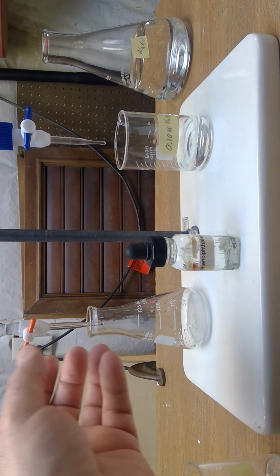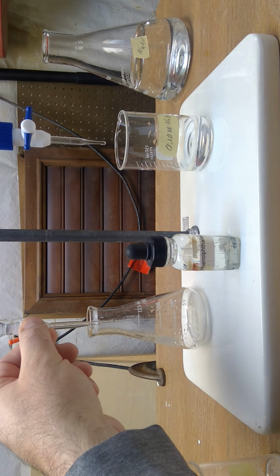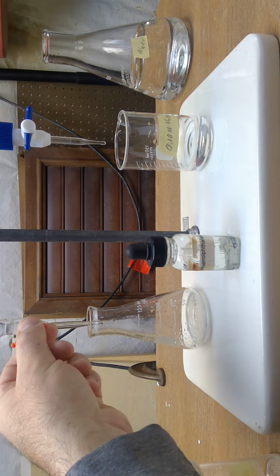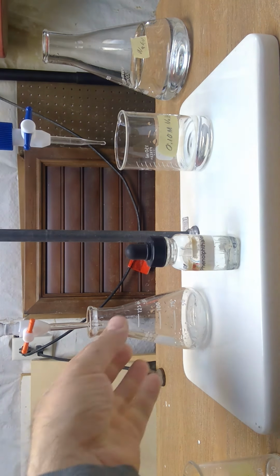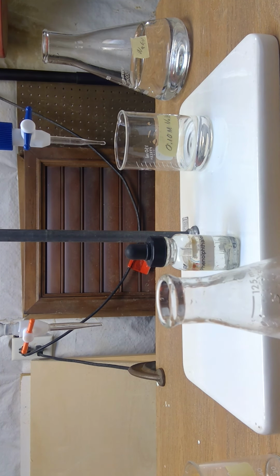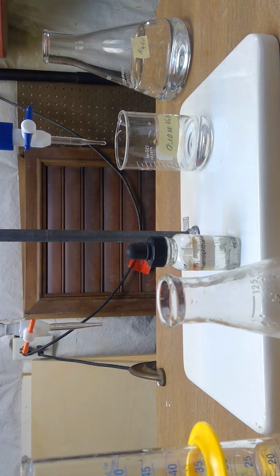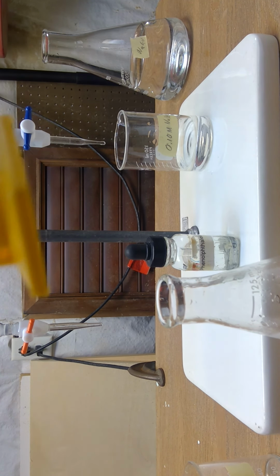So let's go ahead and get our 2 milliliters of our acid. So there's exactly 2 milliliters, which is not very much. We need about 20 milliliters of distilled, and it really doesn't matter. It's just going to give us some volume. Okay, so we got about 20 milliliters of water, so we're going to add that.